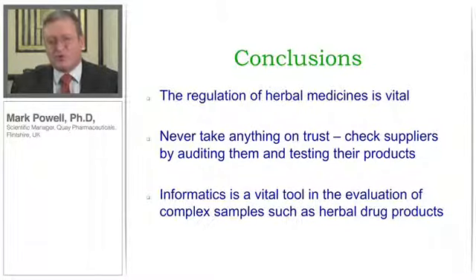And the other important component of this work is, of course, the informatics. It would be very, very difficult to do what we did in terms of comparing the composition of the different batches of herbal capsules without data reduction software.